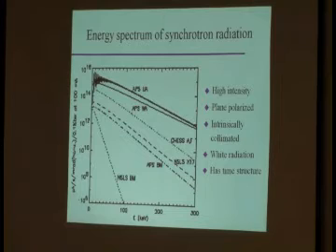There's one other synchrotron on here, CHESS, which is at Cornell in Ithaca. That is actually where my group sometimes does measurements. Where would copper K alpha be on this scale? Well, copper K alpha is 8 keV, so that's down here. And it would probably be somewhere around here on this graph, in that lower corner. You have orders of magnitude more intensity at a synchrotron source, and you have a whole wide range of wavelengths that you can choose from.